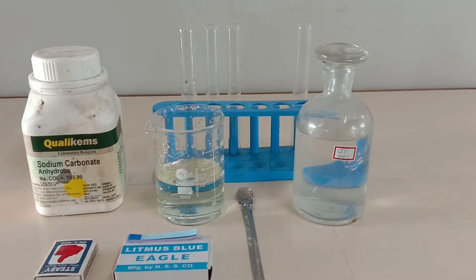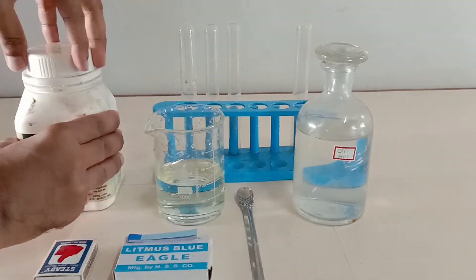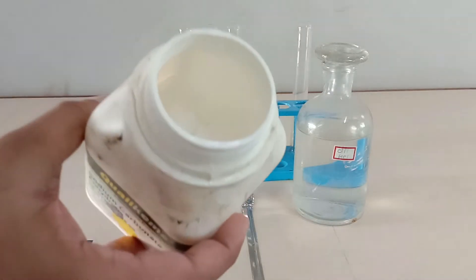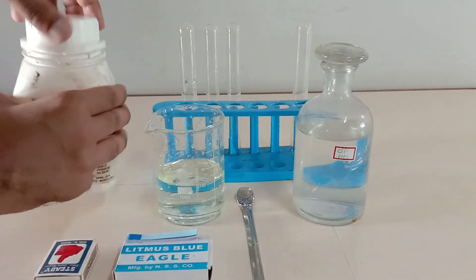Hello scientific audience, how are you all? Today I'm going to demonstrate the reaction between sodium carbonate and dilute hydrochloric acid. For this reaction we would be requiring the sodium carbonate — it's a white color powder, crystalline solid, as you can see.